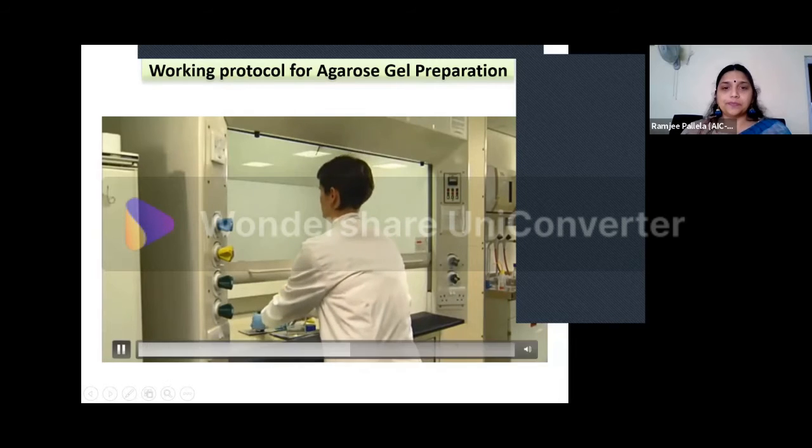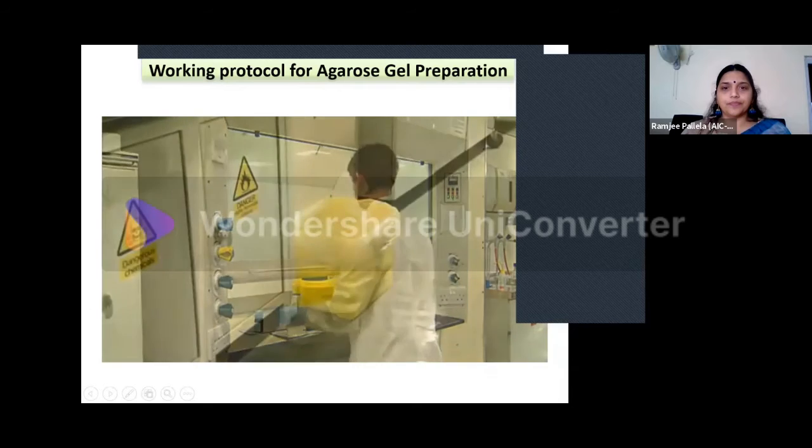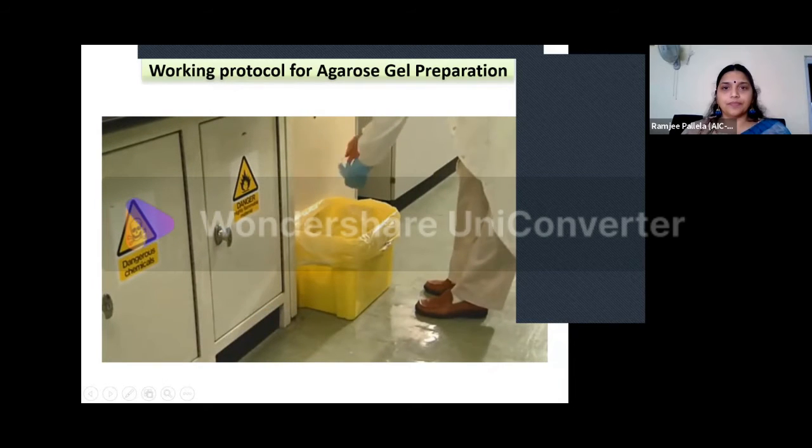It can be both absorbed through the skin and breathed in. Immediately after handling ethidium bromide, change your gloves to avoid contaminating other instruments or parts of the lab.